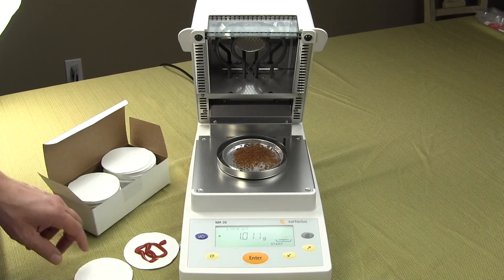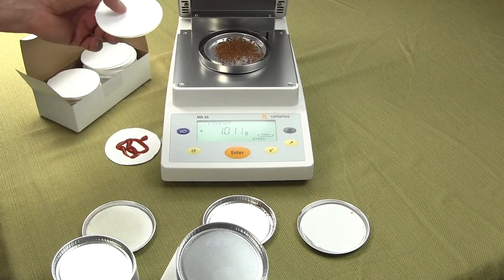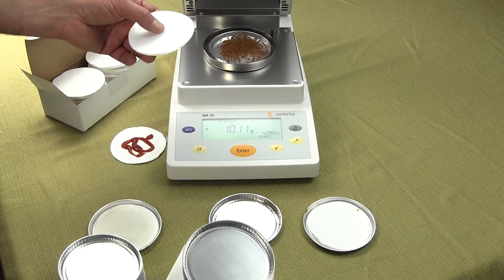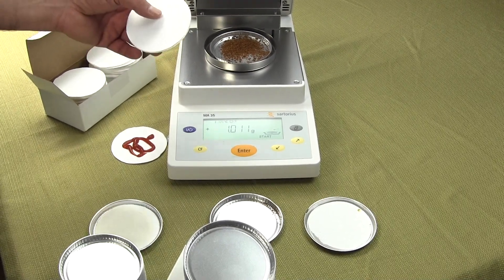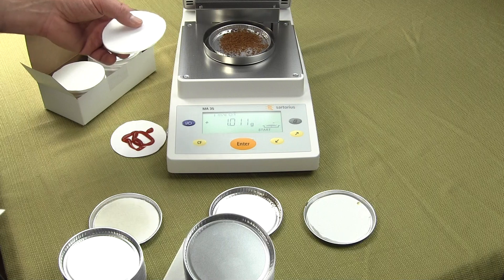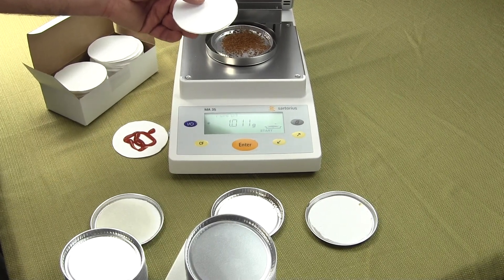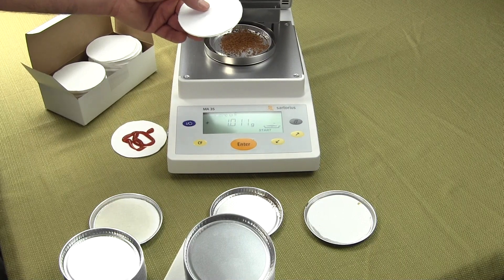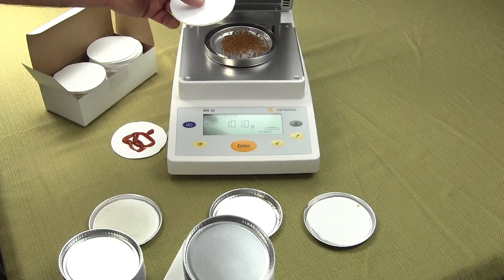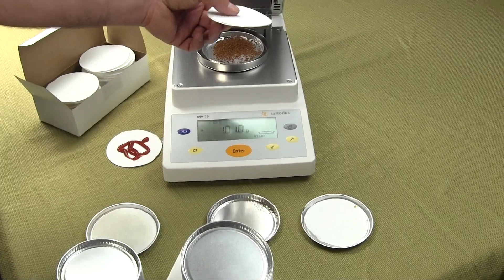The filter pads are binder-free and should be used for any kind of slurry where you get skinning, bubbling, or spattering during a moisture balance test. Using filter pads will give you better results. If you are working with any liquid substances that are 70 percent water or greater, you definitely want to use these filter pads — just use a syringe to spread the material. The goal with any clumpy substance is to maximize surface area, so there are no clumps.